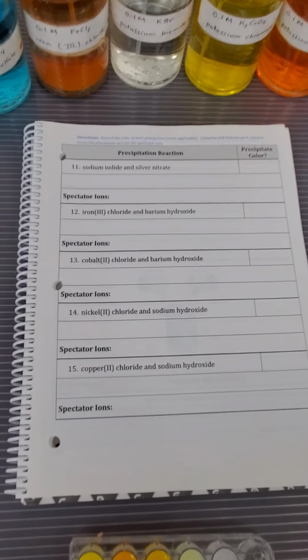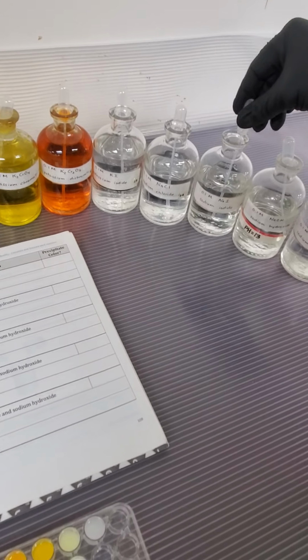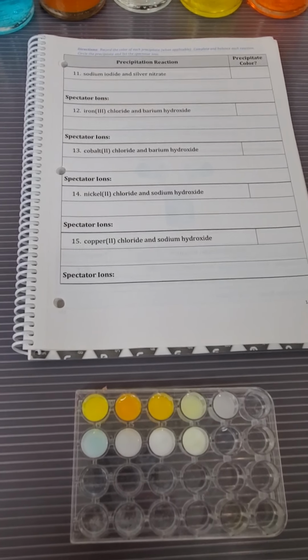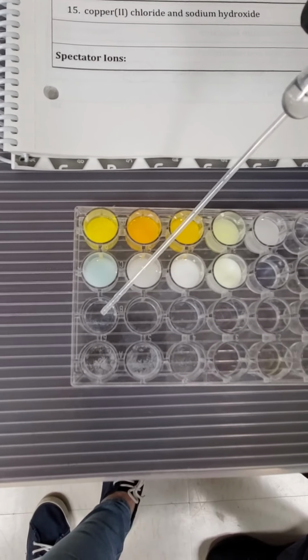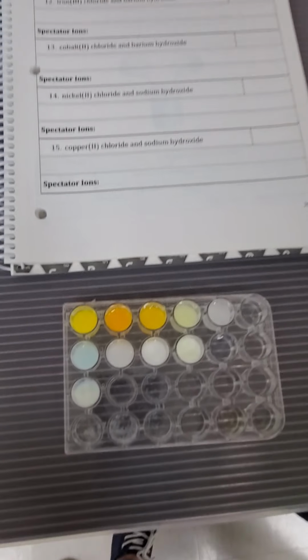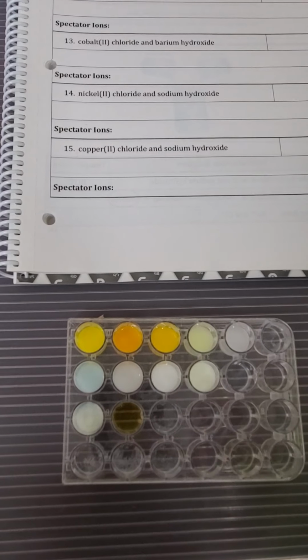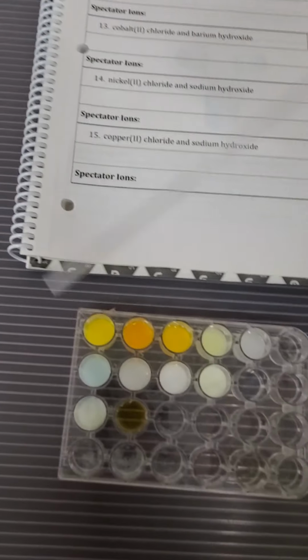All right, we're back for page 3 of our precipitates. We have sodium iodide. We need silver nitrate. You can probably expect what's going to happen next. We have iron 3 chloride. And now barium hydroxide. Hydroxides aren't well behaved.